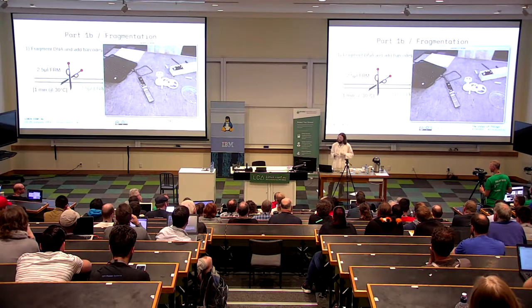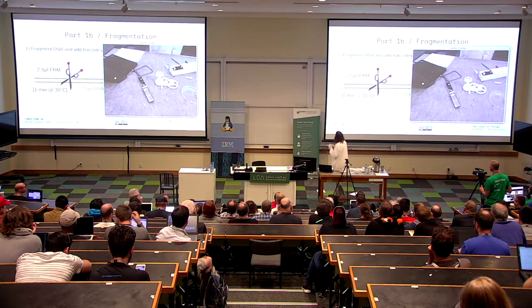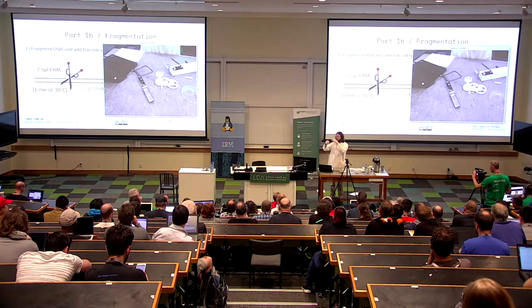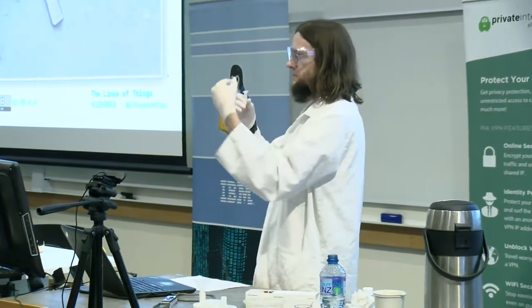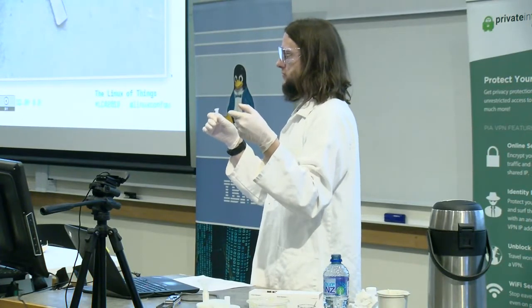Can I explain what a barcode is in this context? A barcode is a thing that is inserted into the DNA to attach onto the DNA so that when I do the sequencing and read the DNA, it will also read the barcode at the same time. So the barcode is a piece of DNA that uniquely identifies a sample.